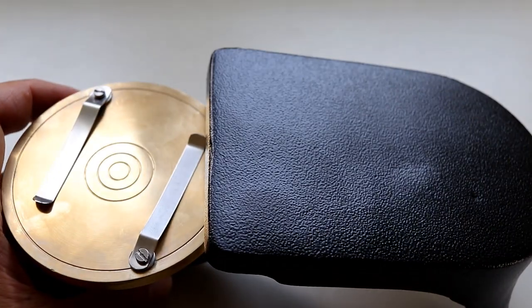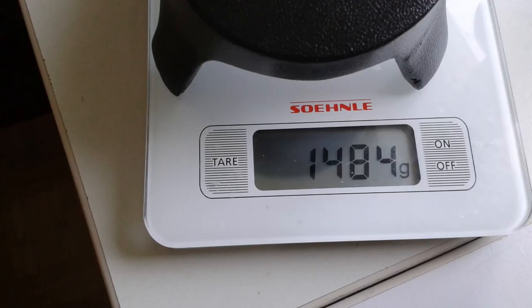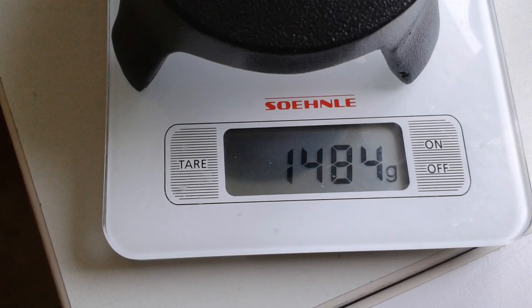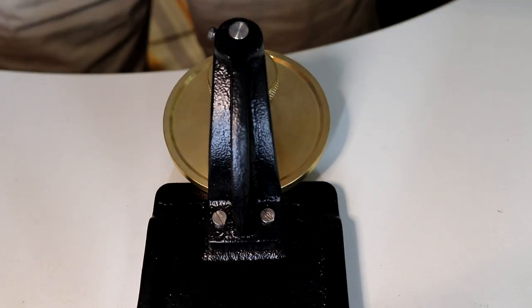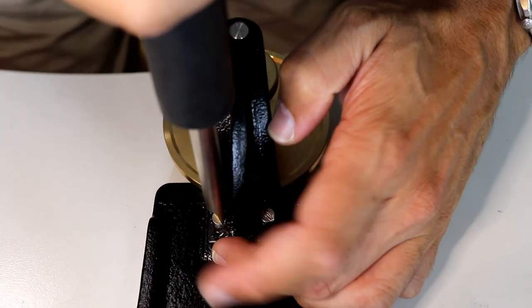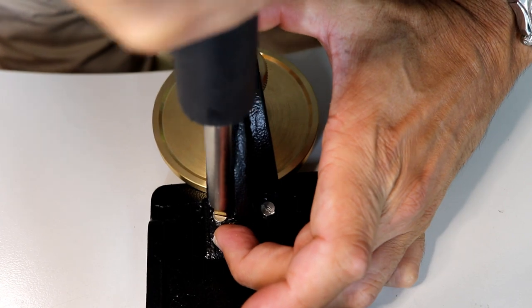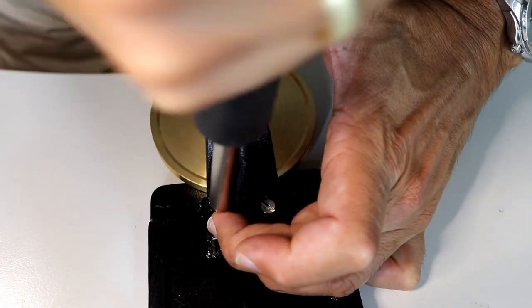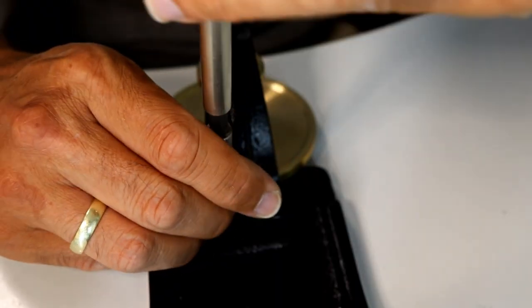I put everything on the scale and it was almost one and a half kilograms, so as I mentioned, it's quite solidly made. I couldn't resist—I just wanted to actually see now what actually is it that causes the rotating table to run so efficiently. I wanted to have a closer look. I was actually looking out for ball bearing or something like that.